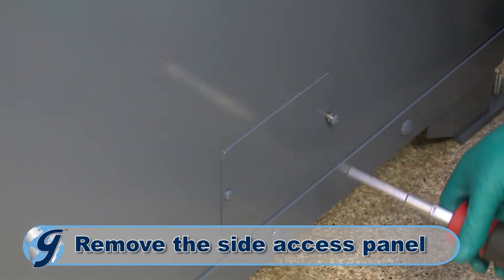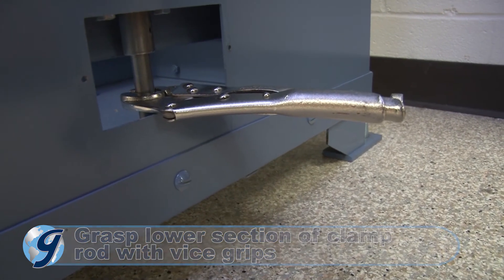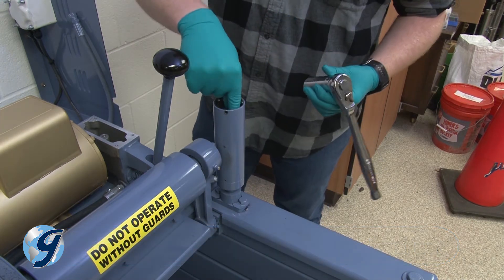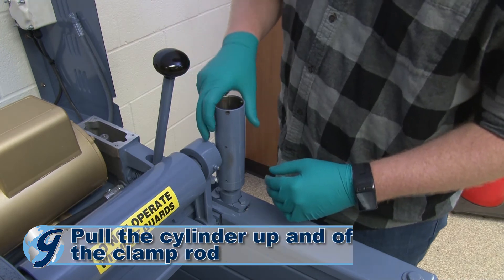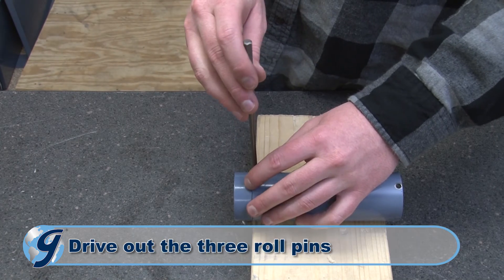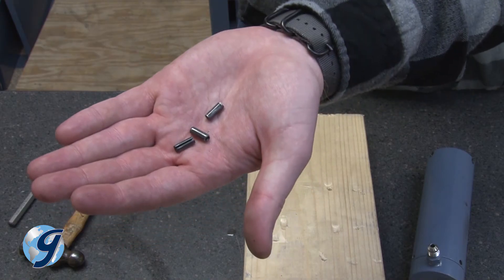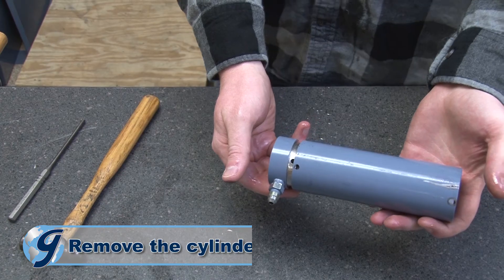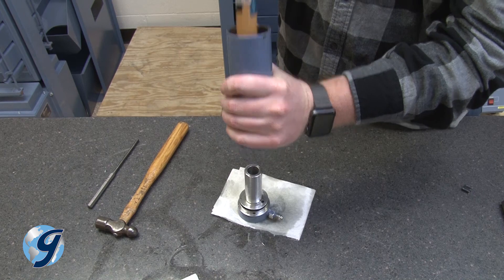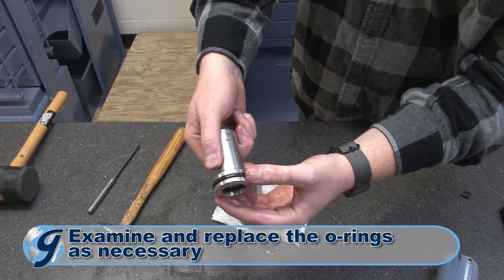Remove the cap and spring and set aside. Next, remove the side access panel near the machine's base. Grasp the lower section of the clamp rod with vise grips. Now, unscrew the clamp rod hex jam nut within the cylinder. Next, pull the cylinder up and off the clamp rod. Use a drift punch to drive each of the three roll pins on the cylinder through the center hole until they all fall out. Remove the cylinder base assembly and the hydraulic cylinder piston. Examine the O-rings and replace as necessary.